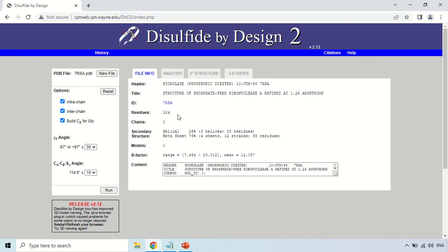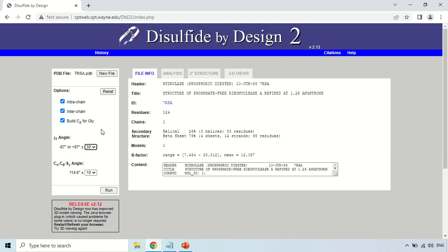In order to find out the disulfide bond, in the left-hand section you first choose what kind of disulfide bond you want to predict. 'Intra chain' means disulfide bonds within a chain; 'Inter chain' means disulfide linkage between two different chains. There is also an option to build C-beta for glycine, since glycine causes hindrance in disulfide bond formation. Chi-3 is the torsion angle with a range of minus 87 to plus 97 degrees, and you can choose a range of plus or minus 30 — keep it as default.